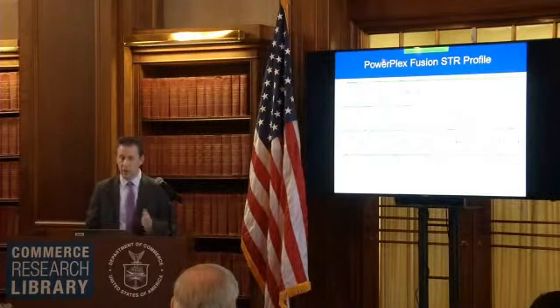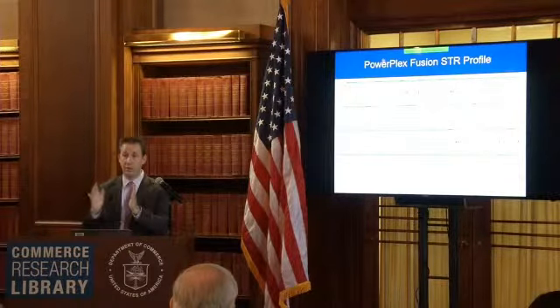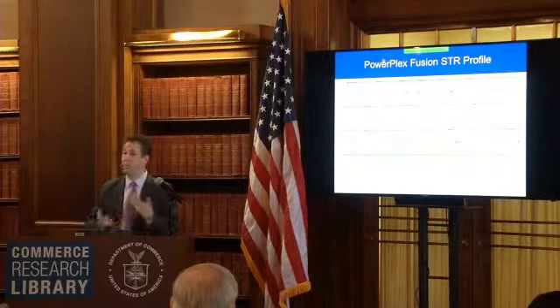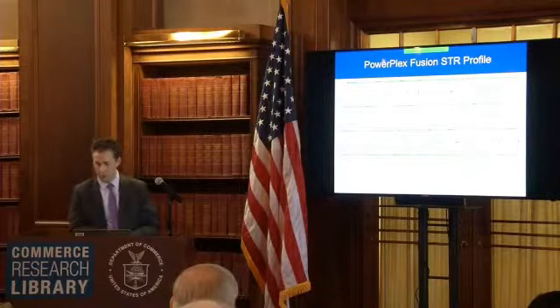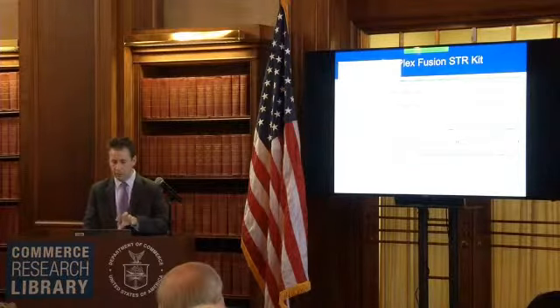So this is what an analyst would do. They would look at this profile, look at these peaks. There should be really no more than 2 peaks at a specific marker because you only have 2 chromosomes. If you had 3 or 4 peaks at a marker, you would think you have a mixture. That would be common in a forensic case because you may have a mixture of 2 people's blood or fluids, things like that. So this is essentially what a profile looks like.